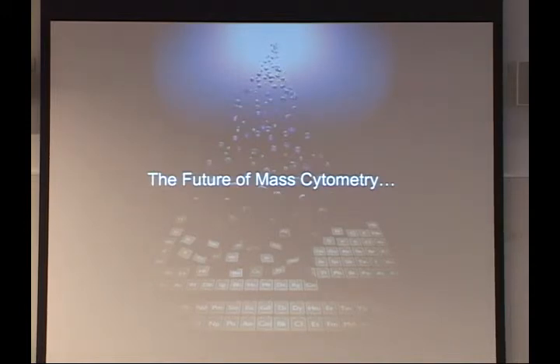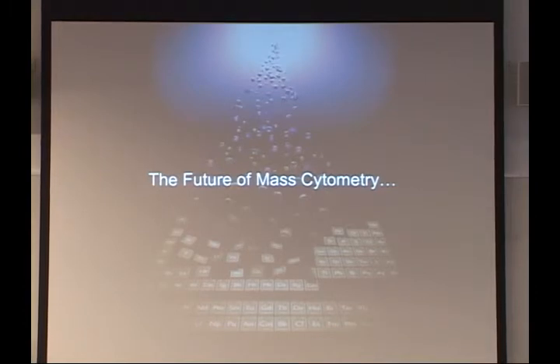People are going to talk to you about really, really high-dimensional T-cell analysis, where by leveraging 20-plus parameters, looking at cytokines and surface markers of a T-cell, you can actually dissect different virus-specific T-cell populations within what was thought to be a fairly homogeneous compartment. People are going to talk to you about really high-level apoptosis and cell cycle measurements, as well as more of the nuts and bolts of how we can analyze this data and leverage it to look at single-cell systems in a new way.